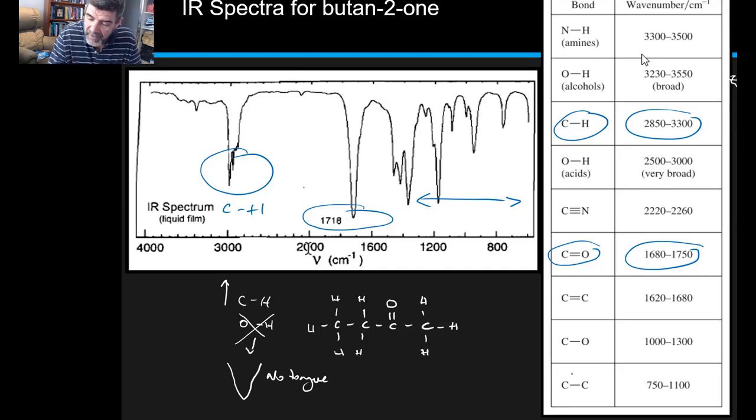For example, we've got carbon-carbon bonds. We know that there are definitely carbon-carbon bonds, and they occur between 750 and 1100. There's a few of those in there.